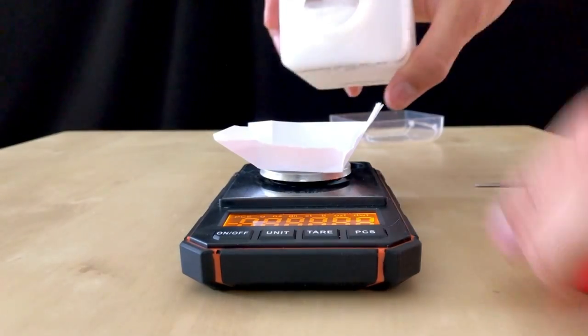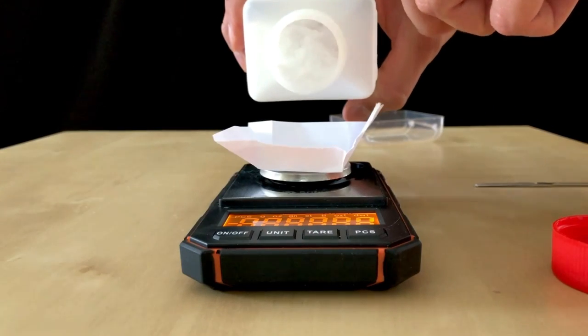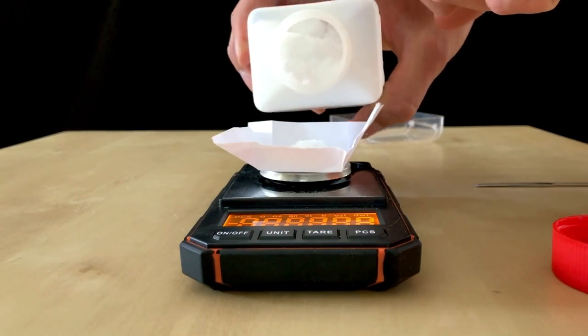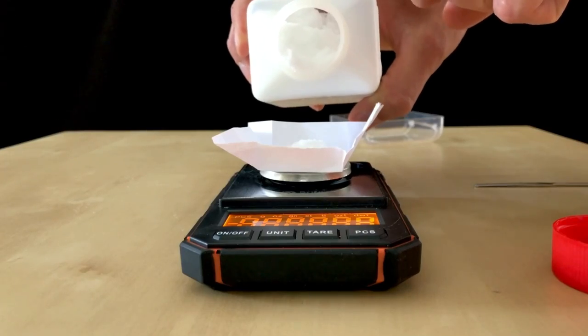In order to avoid contamination of the potassium iodide, I didn't weigh it out using a spatula but I transferred it onto the paper directly. We used 4 grams of potassium iodide.